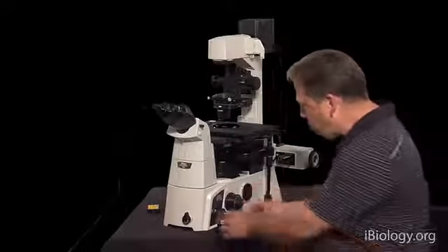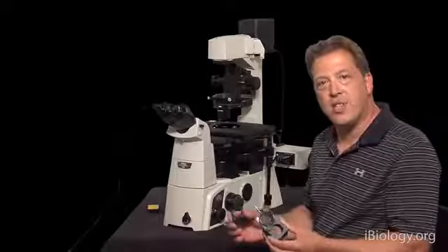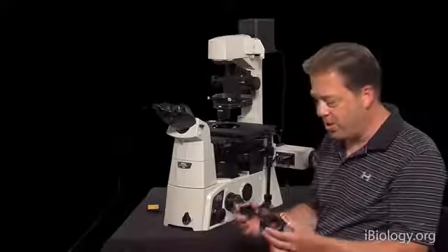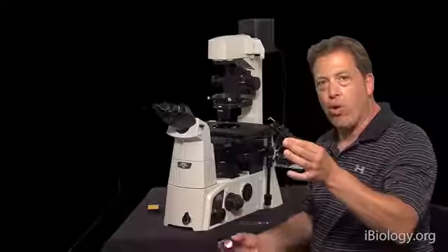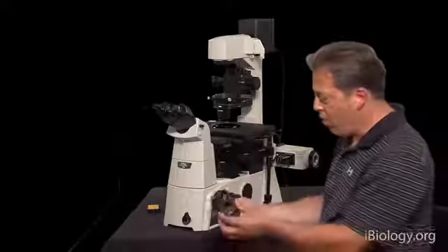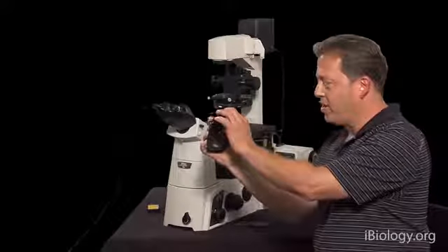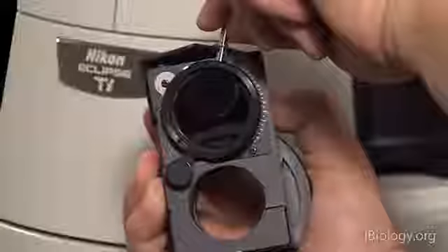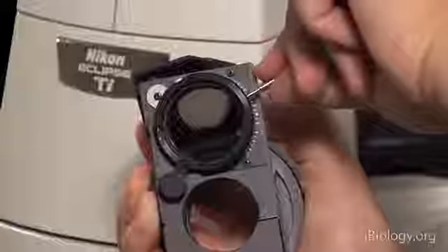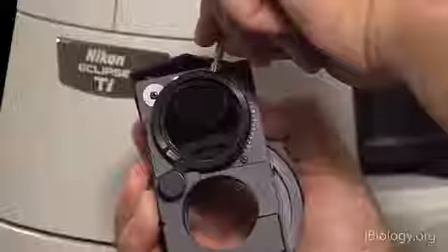Okay, so two of the critical components, we're going to start with polarized light in a very simple way, polarized light as it relates to differential interference contrast, or DIC. We have what's called a polarizer and an analyzer, which is basically another polarizer, that when you cross these two, you get to a point of extinction where the light is no longer coming through, and as you rotate off extinction, you can see the light coming through.